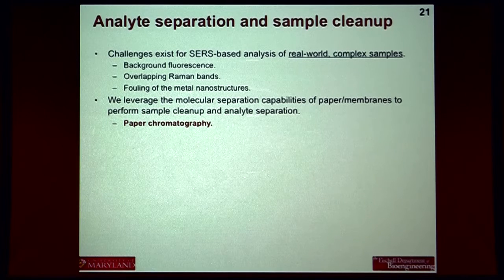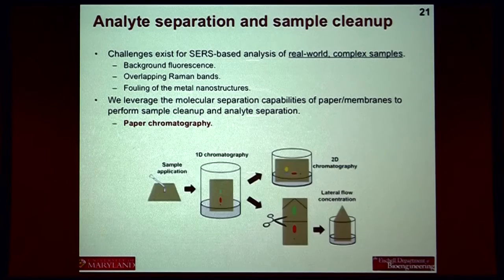So ultimately, people use a sample cleanup. And usually that's somewhere else in the system. We collect the sample, we clean it up, we load it into the device, we do detection. Maybe you remember from middle school or grade school doing chromatography on paper. So the idea is we can actually use that paper to separate out the components of the sample before we detect it. So again, single device that performs multiple functions to come together in a system.